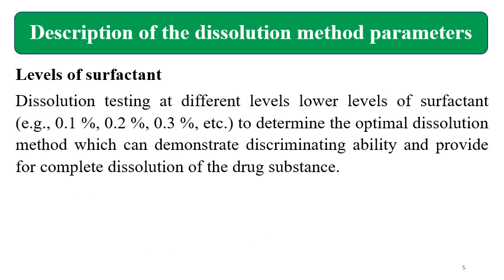Then levels of surfactant. If the dissolution cannot proceed with a medium without surfactant, then surfactants are required in the dissolution medium, and surfactants are evaluated. Once you select the surfactant which is suitable for the method and the product, then levels of surfactant are required to be tested.